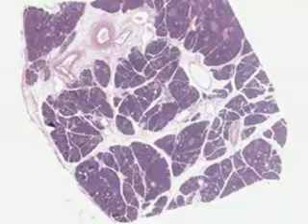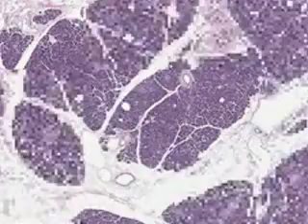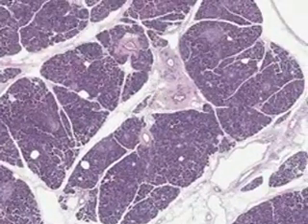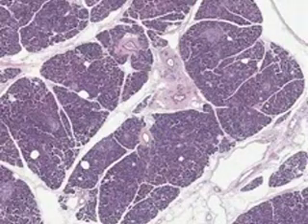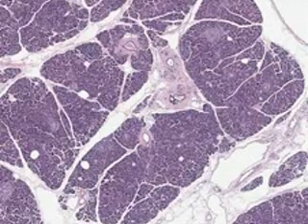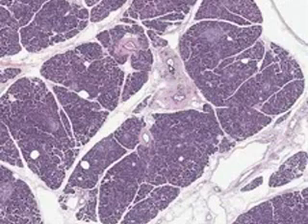Notice also that, like in any exocrine gland or the other salivary glands we saw, you can have ducts that are within the acini, like here, and ducts that are within the lobe, or ducts that are outside the lobe. So these would be called intralobular ducts, and there are several different kinds. And these can be called extralobular ducts or perhaps interlobular ducts.